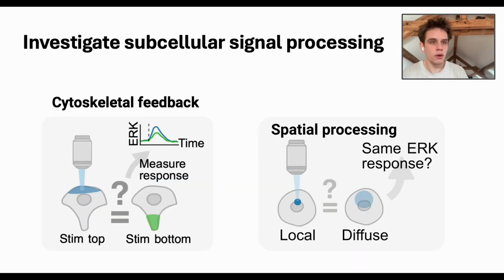So what do we actually use it for? We're interested in, for example, subcellular signal processing. We can test experiments where we're interested in whether there's a difference if we activate the cell at the top or at the bottom, or if there's some kind of spatial signal processing going on, if the cell senses the differences when the input is very concentrated in one place, or when the same input is spread across a larger area. These are things that people have hypothesized with mathematical models for years, but we didn't really have the experimental paradigms to actually test this.